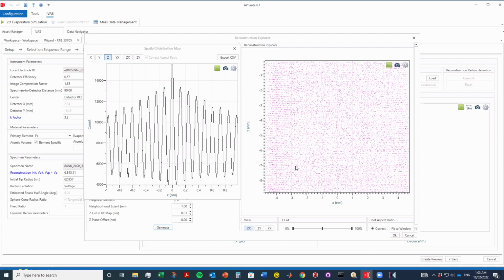Yeah, not yet. Give me a little bit of time. I think Rob's on here, isn't he? He can probably answer a bit better. But it's exciting times here at Sydney. We're coming to the end stages of the installation of the Invisio, and I'm really interested to dig my teeth into some of the data and work out how some of these protocols might change with the new atom probe. I know that we're going to have a larger field of view, so that's going to be great. We'll get more crystallographic information as well as many other things.